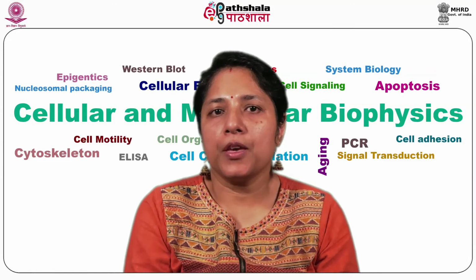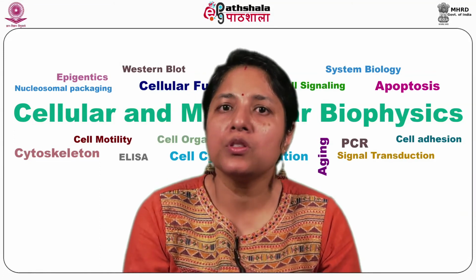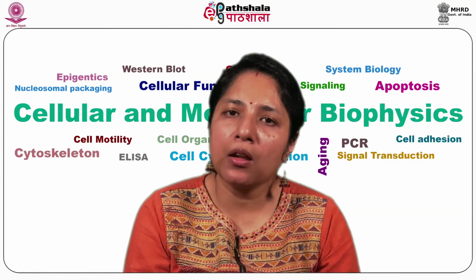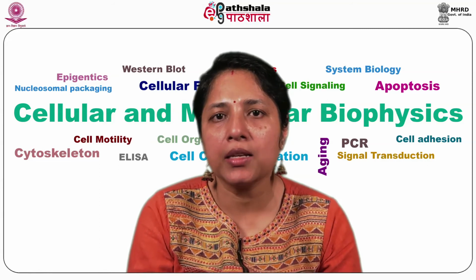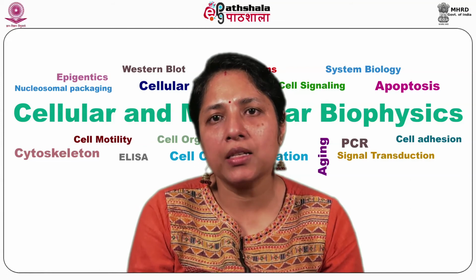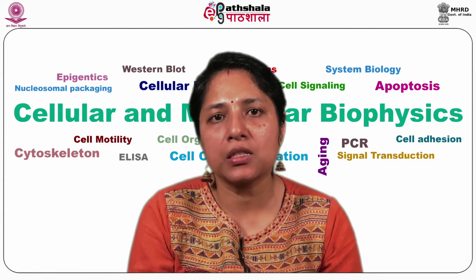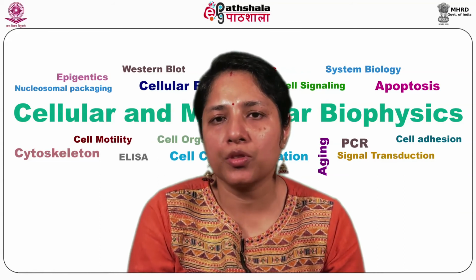Next is the IVM. Intravital microscopy allows for direct in vivo visualization of dynamic biological processes in their physiological context at high spatial and temporal resolution. This has led to important new insights into immune cell behavior at steady state, as well as their change in behavior during an immune response.